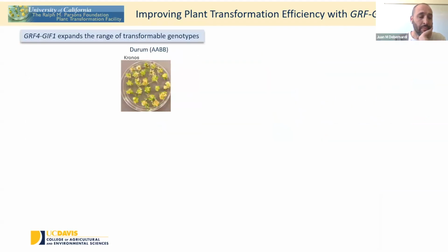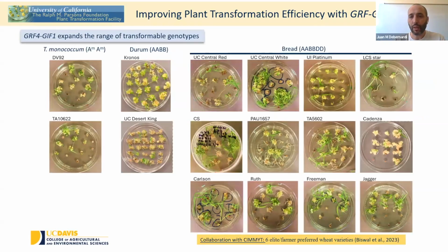Something very important for us and for the wheat community about GRF-GIF was that it allowed us to expand the genotypes that we can transform. And here I will show examples of the work that we are doing in the transformation facility.